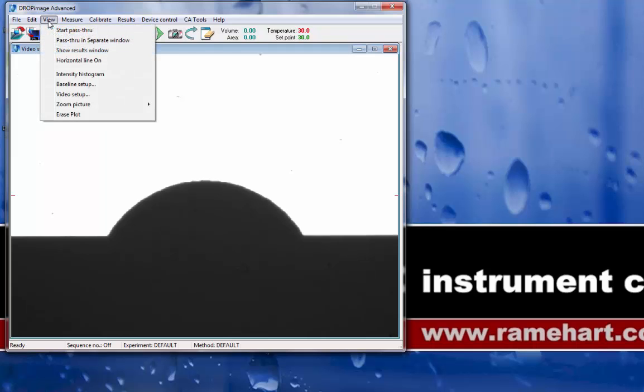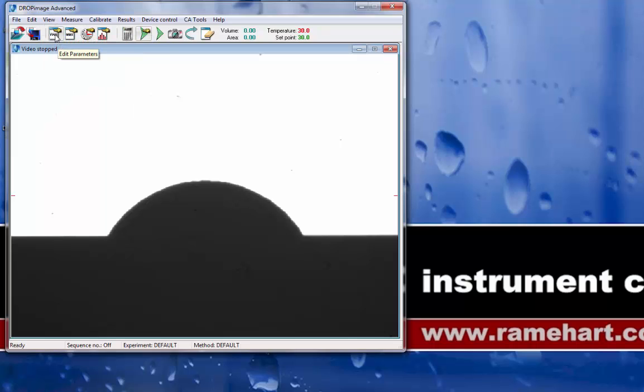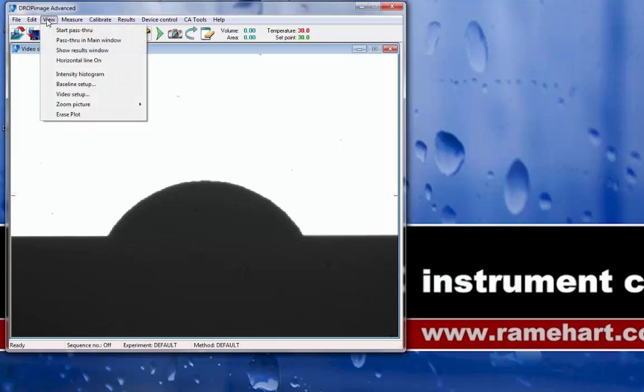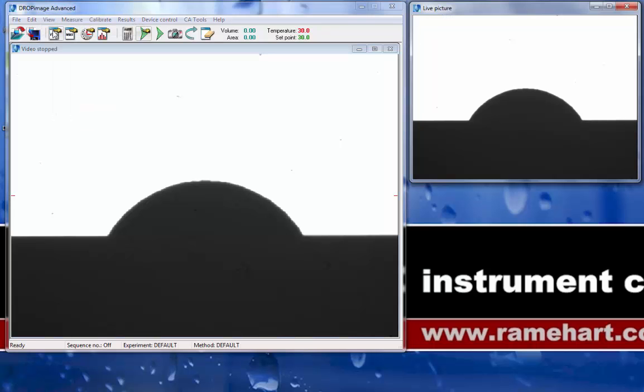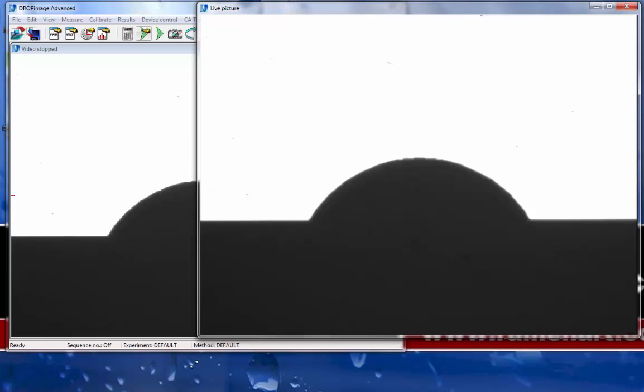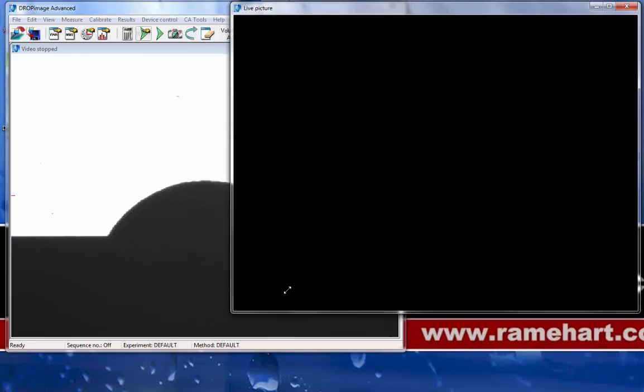Now, I'm going to click on View, Pass-Through, and Separate Window in order to toggle to that two-window mode. And then finally, I'm going to start the pass-through by clicking on View, Start Pass-Through. This restores my live video window over to the right, which can be resized as needed.